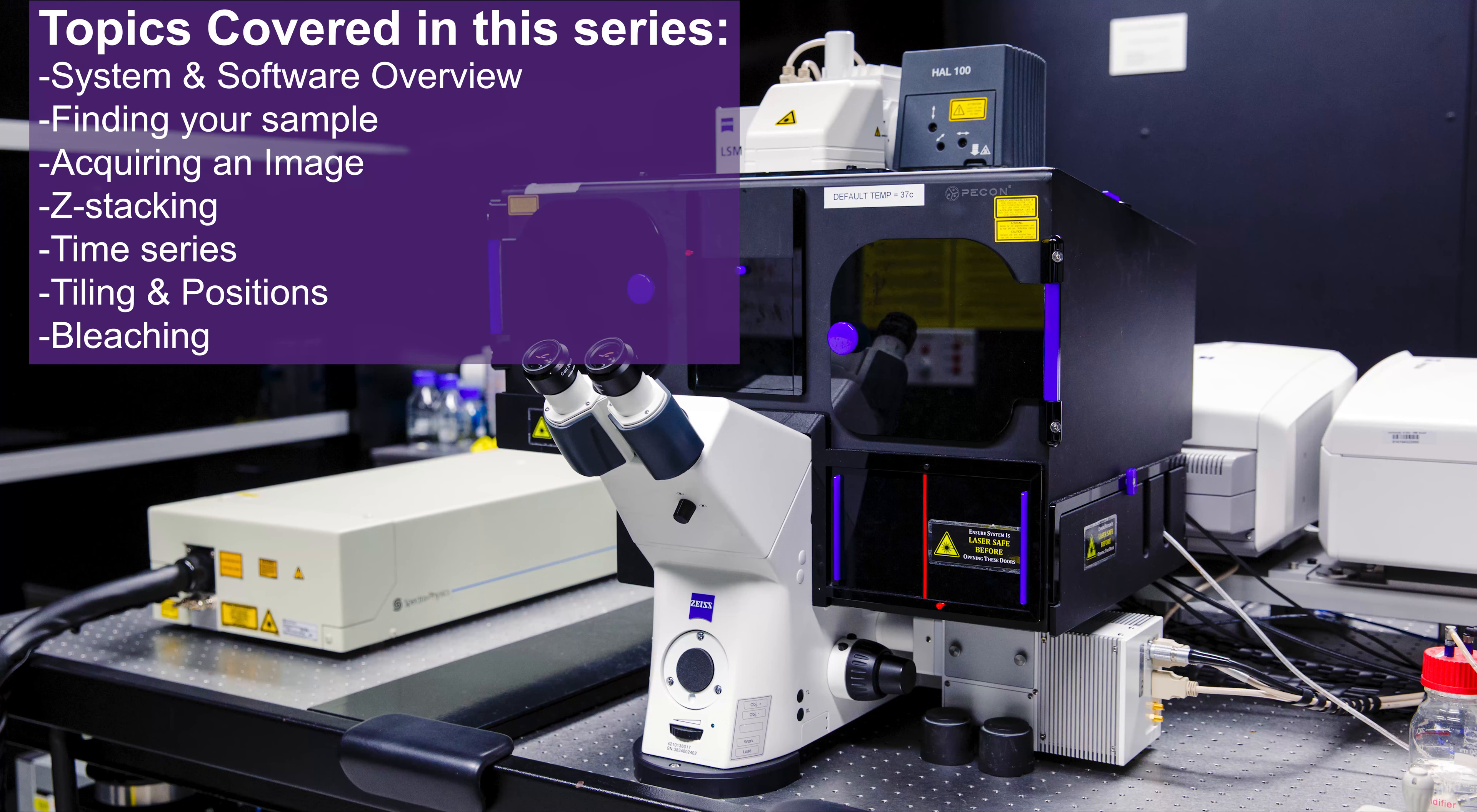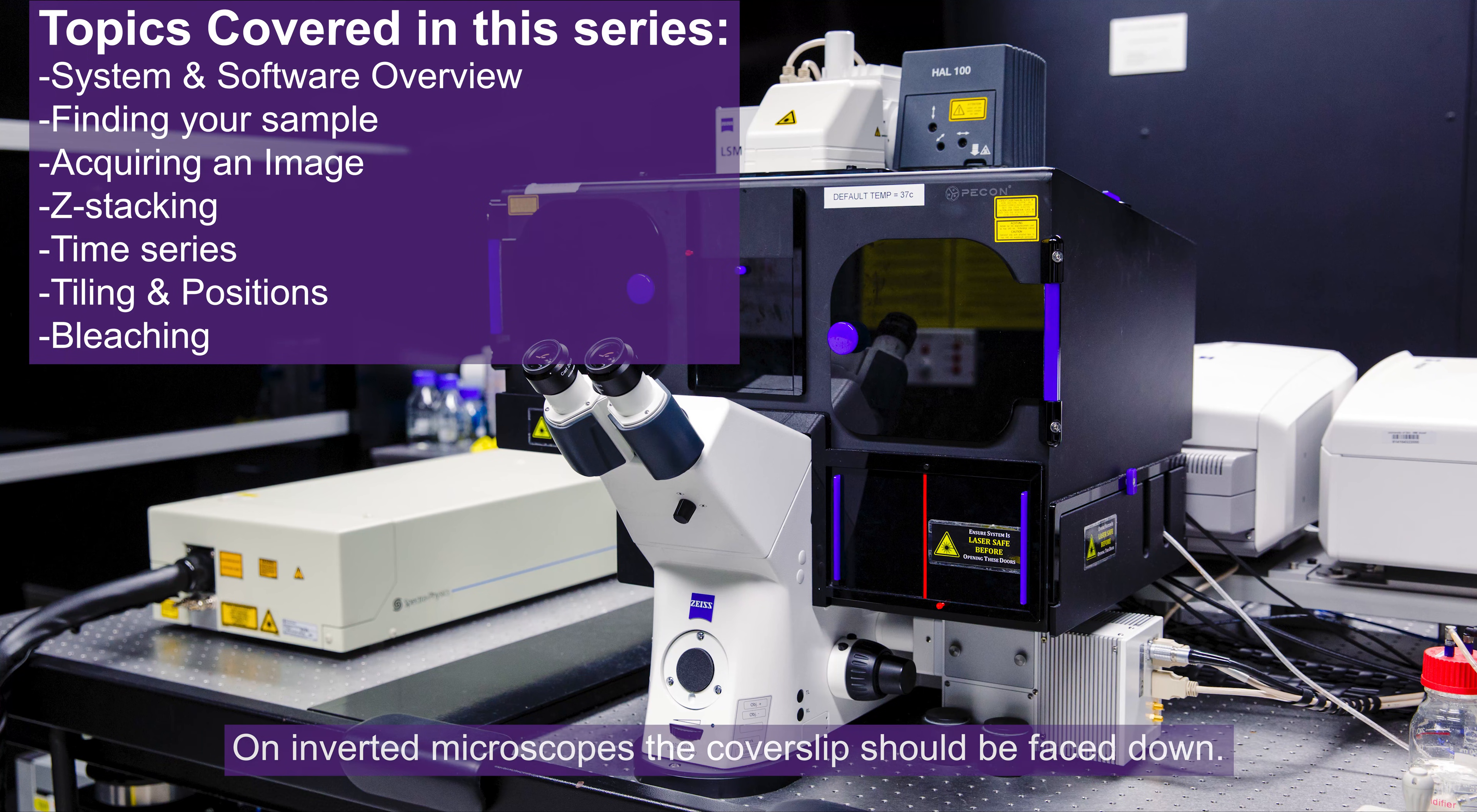This video series will cover all the topics required for basic operation of these microscopes, with topics including a system overview, how to find your sample, how to capture an image, Z stacking, time series, tiling, positions, and bleaching.